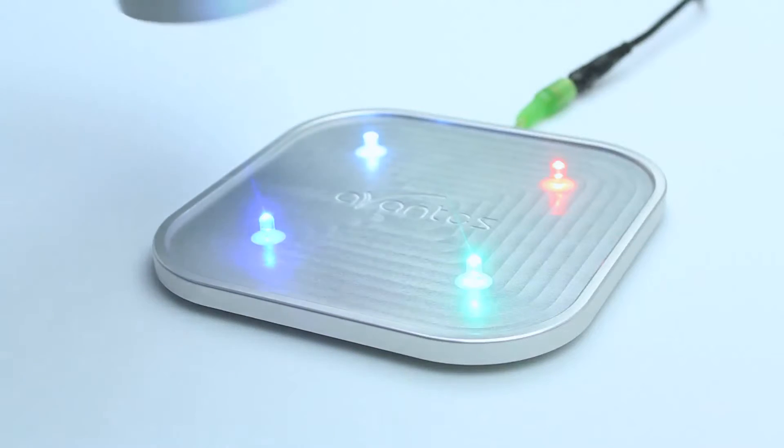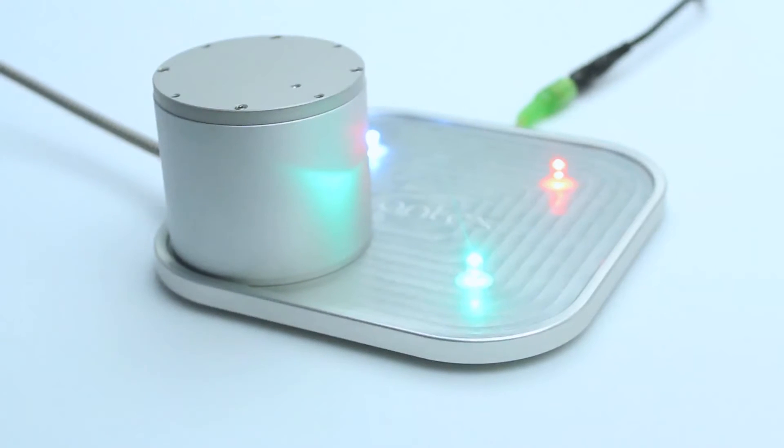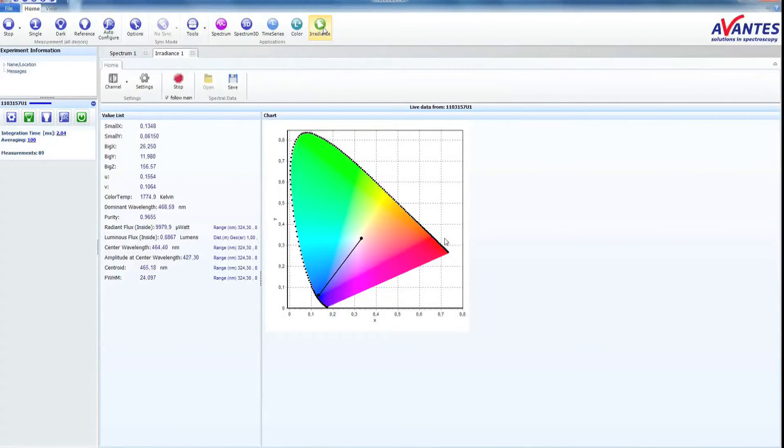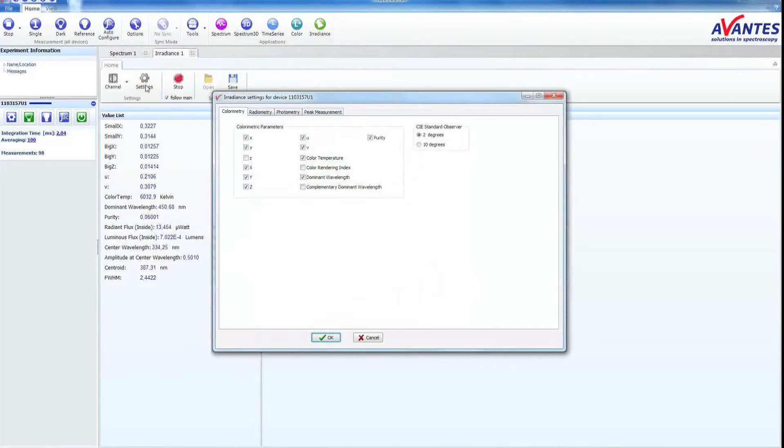Put the sphere on the sample. Click Settings to enter the hardware setup.